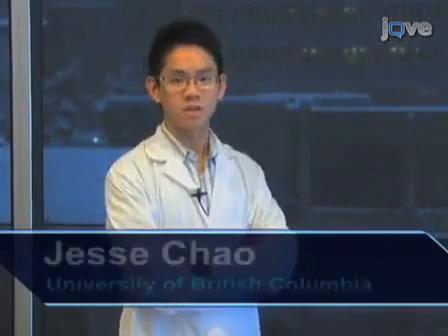Hi, I'm Chao from the Loewen lab in the Department of Cell and Developmental Biology at the Life Sciences Institute of the University of British Columbia. Today we will show you a procedure for quantitative proteomic analysis called SILAC combined with affinity purification. We use this procedure in our laboratory to study protein complexes. So let's get started.